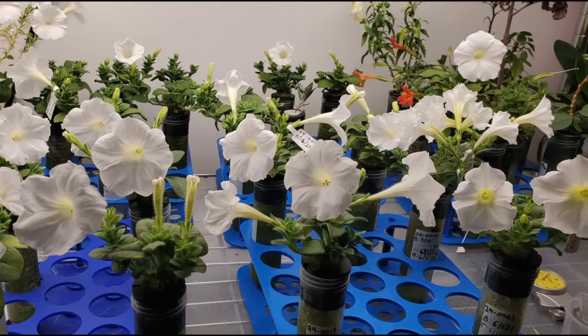Sure. Okay. Let me start with the second question, and then that'll feed into the first. The first is a little bit more elaborate. So gene guns. So gene guns are essentially genetic shotguns, right? And the idea is that if for some reason Agrobacterium-based transformation of your tissue doesn't work, right? Agrobacterium acts like a shark in the water, where it just kind of does its soil bacteria thing until it smells plant blood.